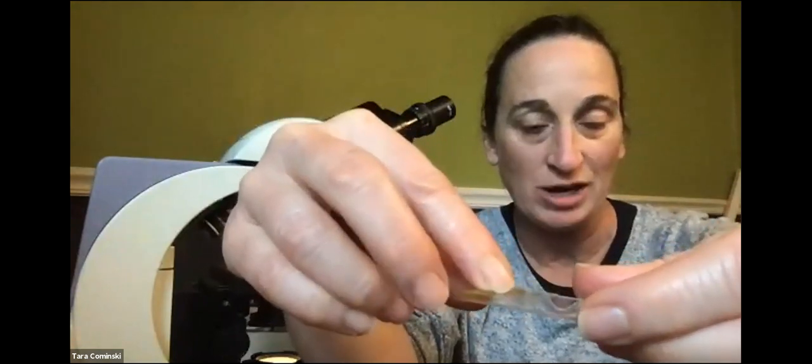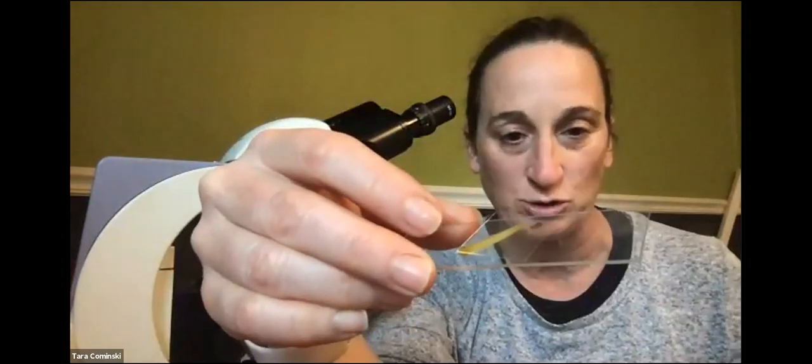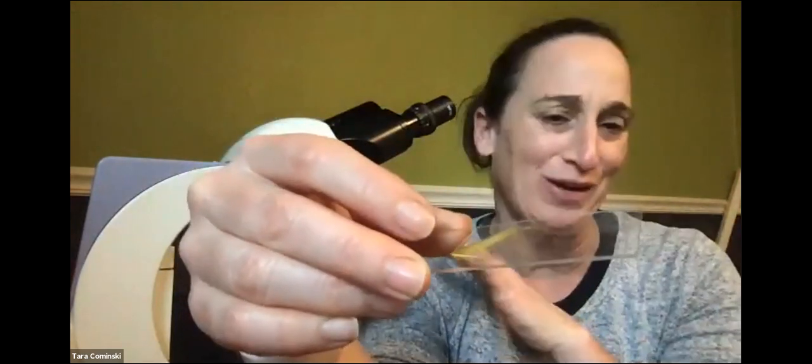Now, this onion is a little thick. It should be thinner. Usually I would use a razor blade, but I don't have a razor blade. So anyway, I'm going to put it under there. If it looks really crappy and you can't really see anything, I'll spare you sharing my screen. But I wanted to show you how you make that wet mount. So again, like I said, you would normally want to cut this much thinner using a razor blade so that it's not raised up so high.